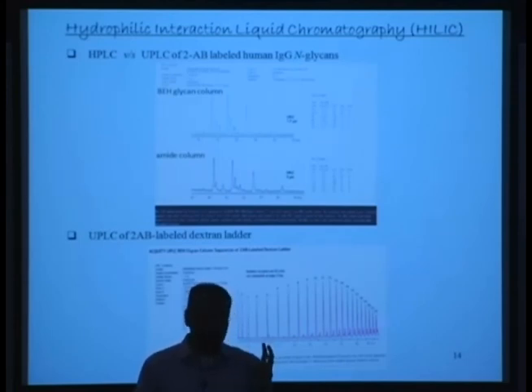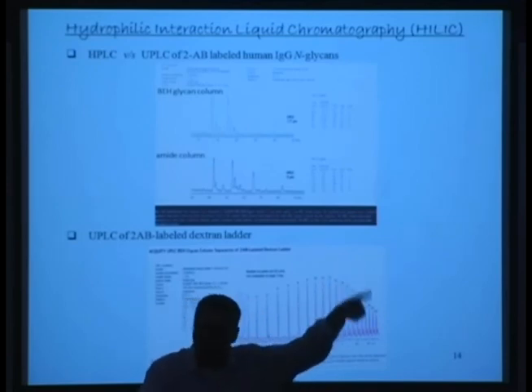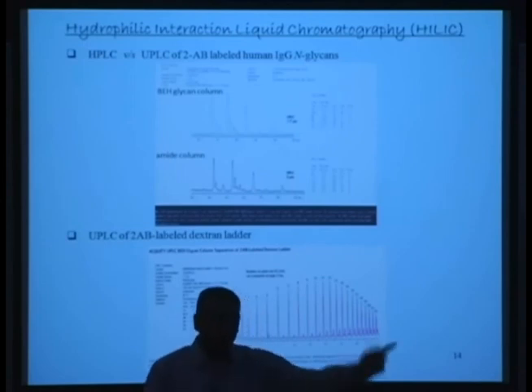So graphite, carbon black, is really used for chromatography. That's the matrix. So let it go on the other side, and I'll pass it on. All of them have it, and they need 2 actually.